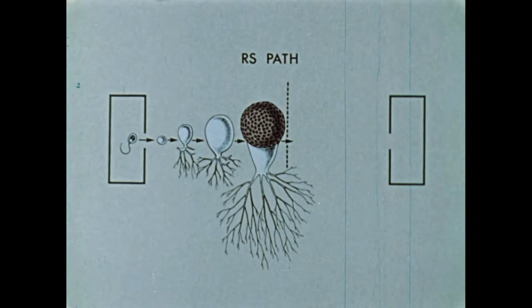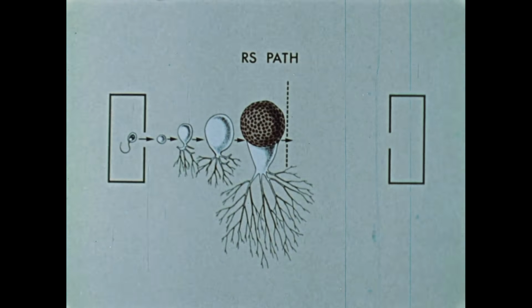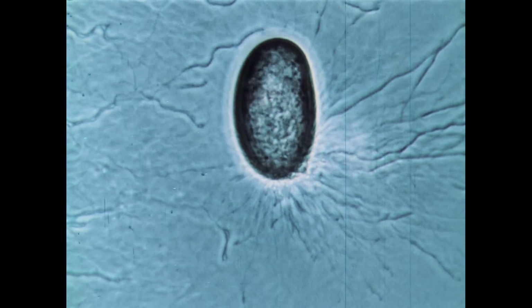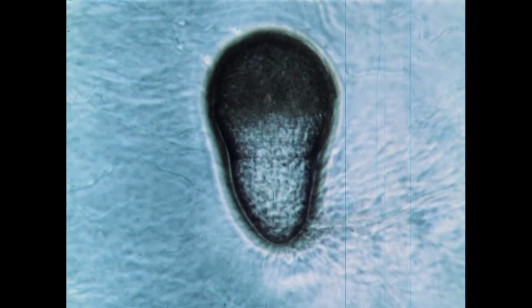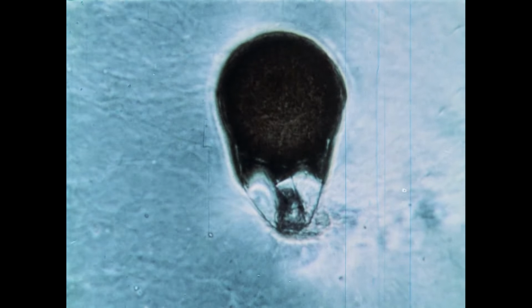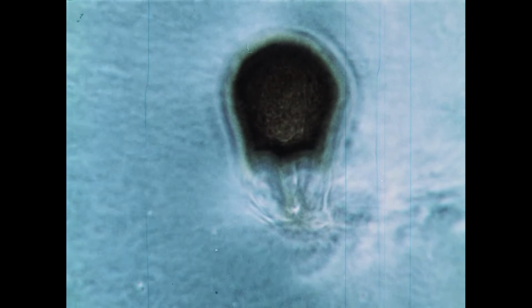When sodium bicarbonate is added to the medium, encysted spores develop into plants bearing resistant sporangia. Such plants grow only about 1/5 as fast as ordinary colorless plants. A cross wall will develop and divide the plant into 2 cells. Protoplasm moves upward and a nearly empty basal cell partially collapses. The upper cell is now a multinucleate sporangium. It forms a thick, brown, pitted wall, and it shrinks as it matures. But no spores are formed within this sporangium.